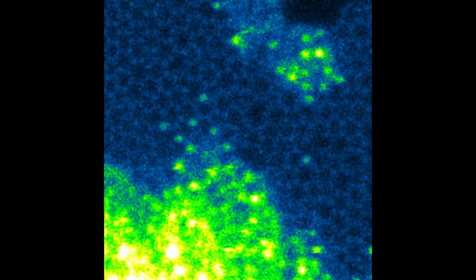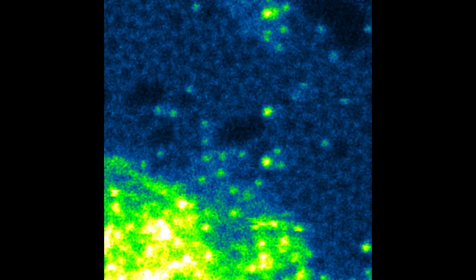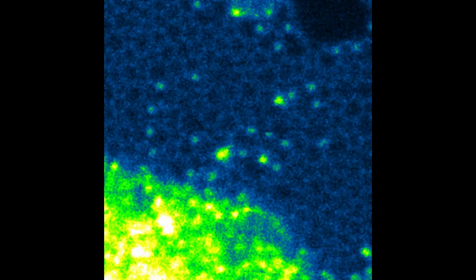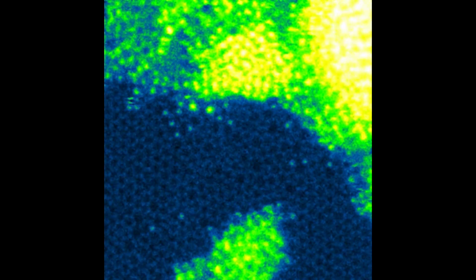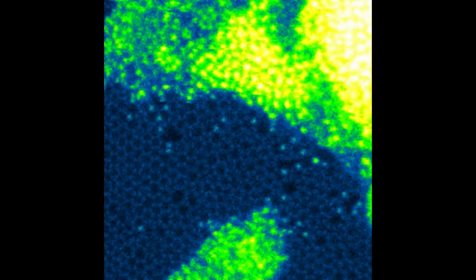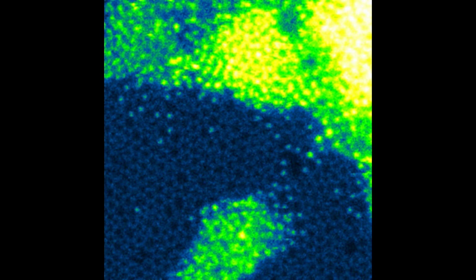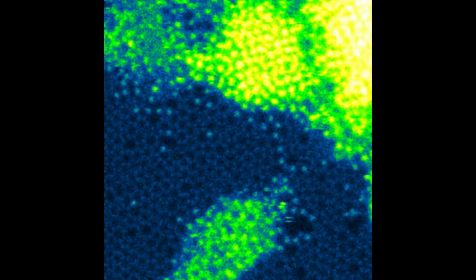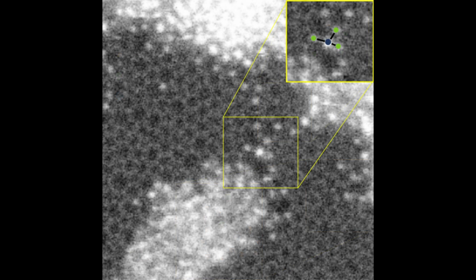In a similar way, we can also examine some of the different heteroatomic structures that can be formed involving both chromium and silicon atoms. These investigations take the first steps toward documenting and understanding the dynamic evolution of few atom systems embedded in graphene using an electron beam. Top-down control of the transformation process remains an active area of research. Machine learning approaches to automated data acquisition and real-time analysis may offer a pathway forward. Links to the publication may be found in the comment section below.